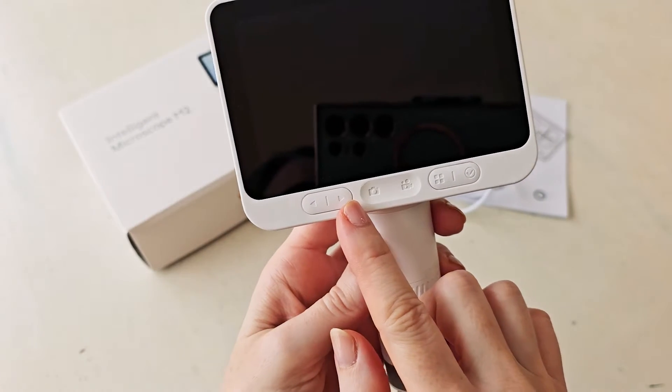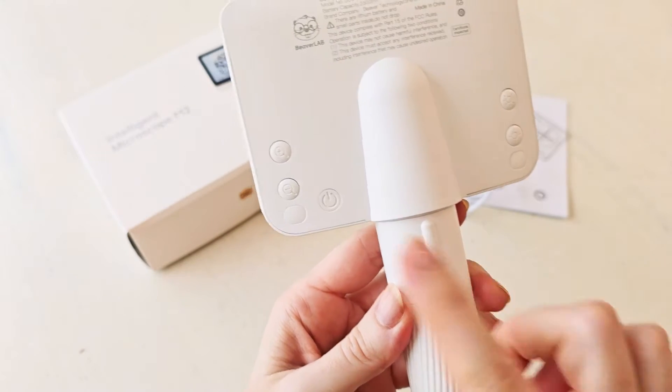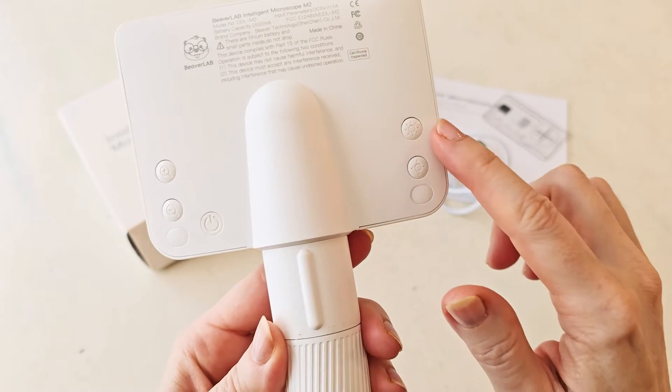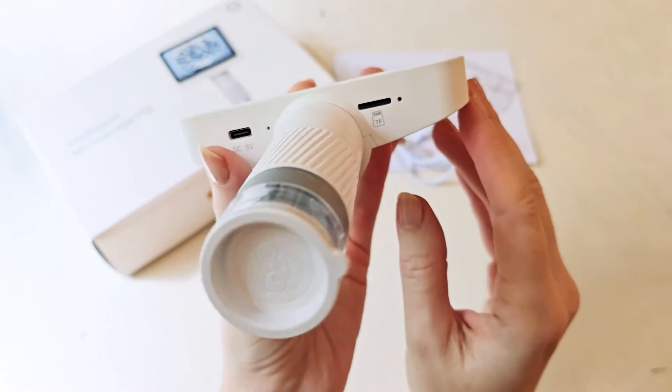It's really high end and really cool, and yet it's still very easy to use — very user friendly. In the front you've got different ways that you can customize it. In the back you've got the power button, and then up and down buttons on either side — one is for the light to make it brighter or darker, and the other is to zoom in or zoom out.